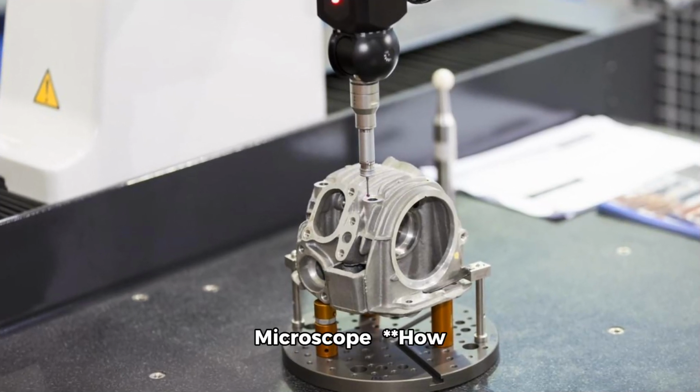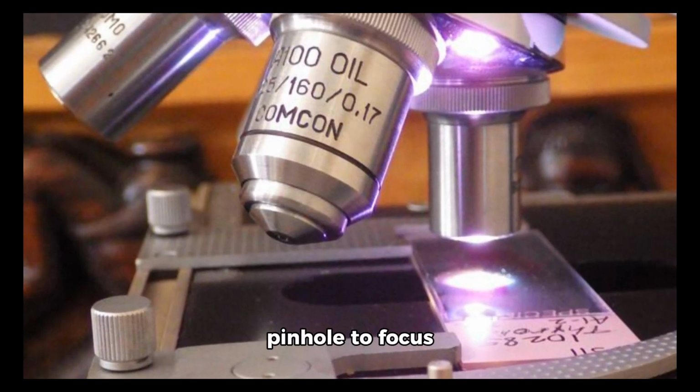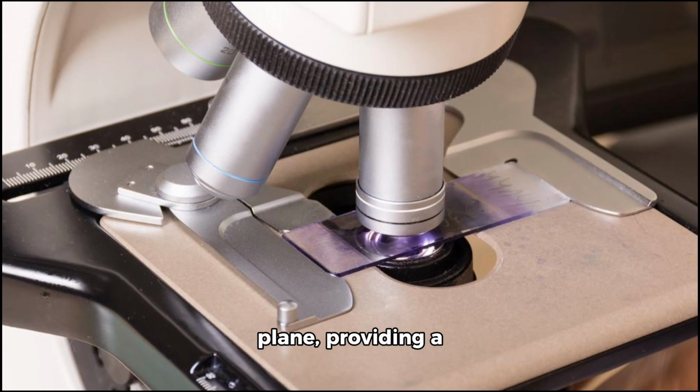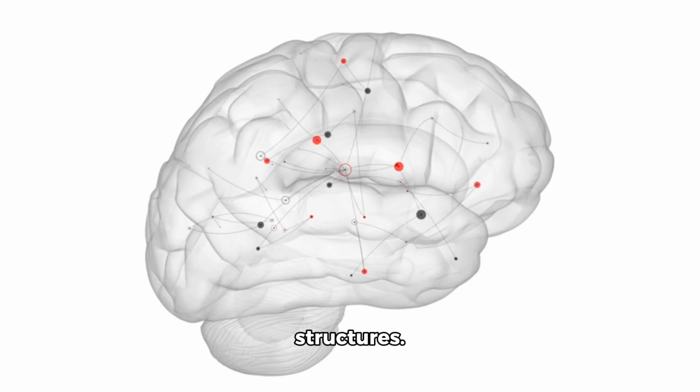Confocal microscope. How it works: uses laser light and a pinhole to focus on a specific plane, providing a sharp image. Example use: neuroscience for visualizing complex brain structures.